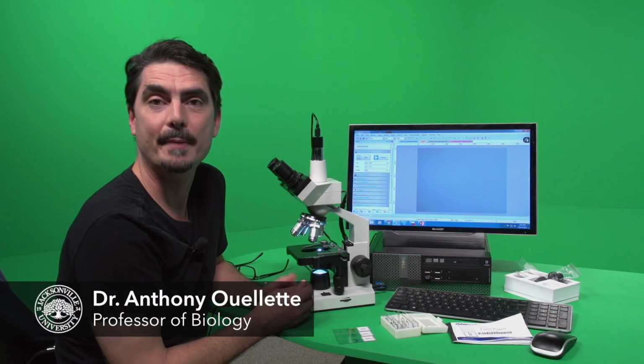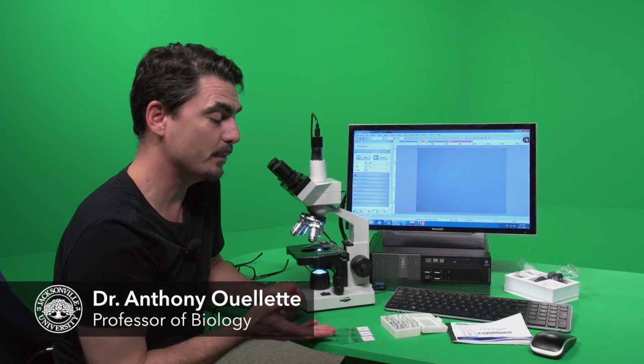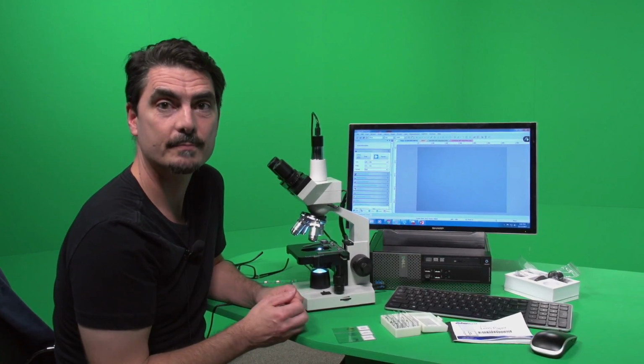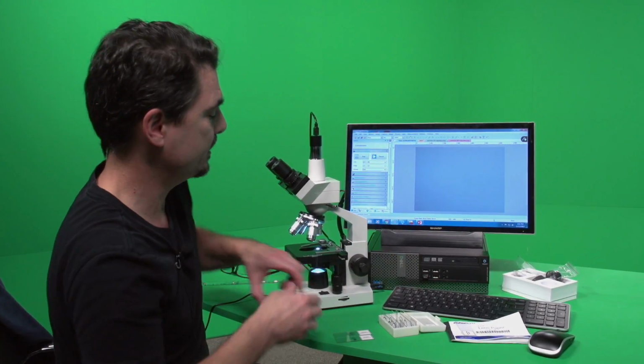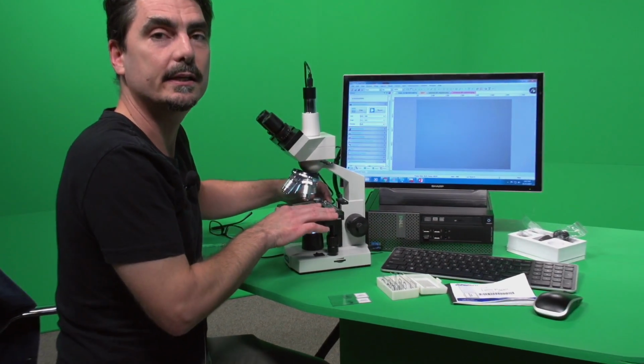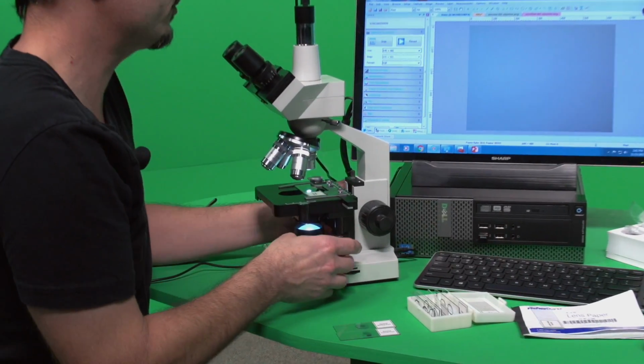So now let's take a look at the prepared bacteria slides. You should have 3 in the kit: the Spirillum, the Bacillus, and the Coccus. We'll go ahead and take a look at the Spirillum first. That's the more unusual one. Very cool. Probably not going to see any of these in the samples you actually make.